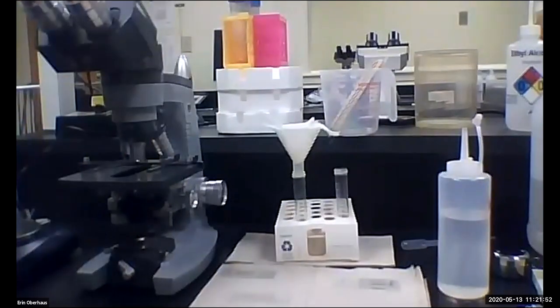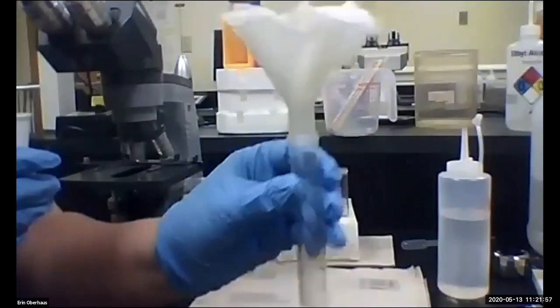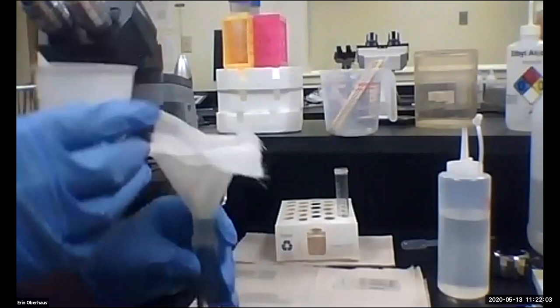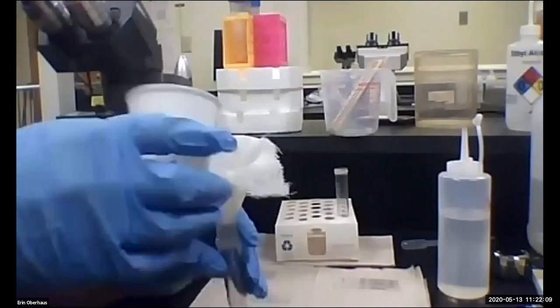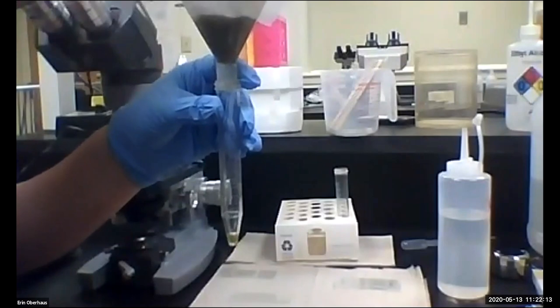And then I have a little funnel here that is attached to my tube with a little bit of cheesecloth. Again, if you don't want to use the cheesecloth in the funnel, you can use a tea strainer. Whatever is adequate for filtering out all of the fecal debris while keeping the fluid behind.